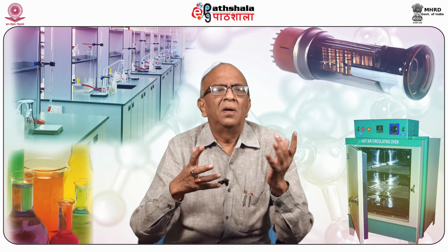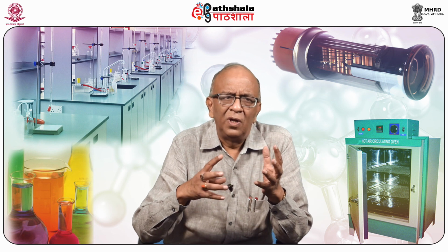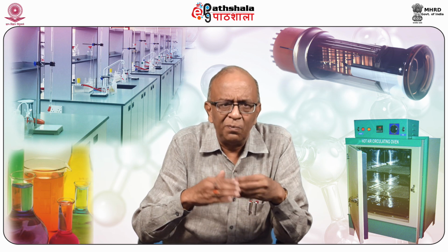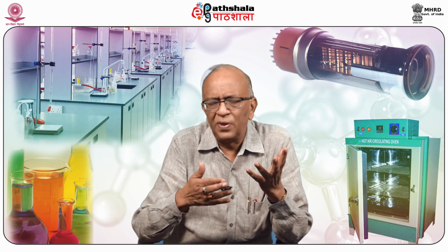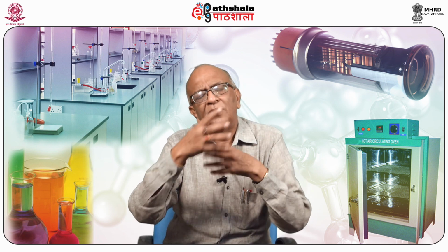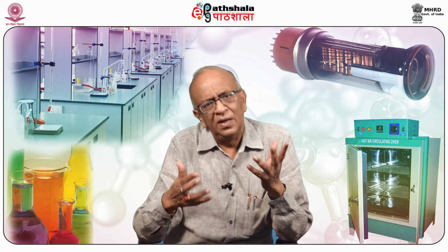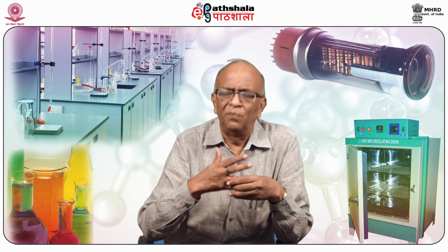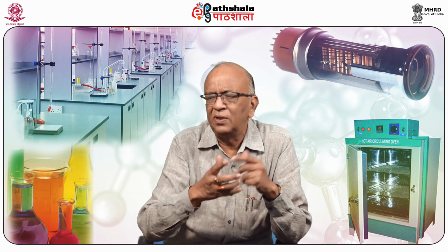Students, as you have seen here, we discussed two types of chromatography: gas-liquid chromatography and liquid-liquid chromatography. One of the limitations of gas chromatography is that only those substances which are volatile at a given temperature, under the experimental conditions, can be separated. But the advantage is that separation is very fast. Within a very short time, a number of components of a mixture can be separated.